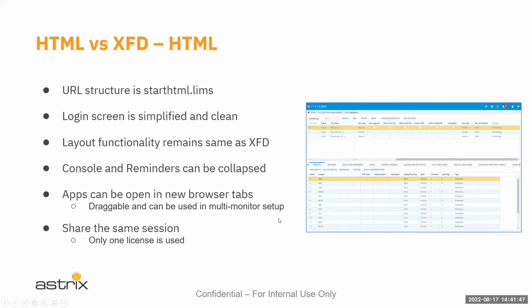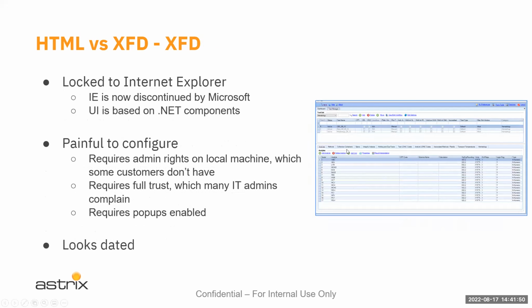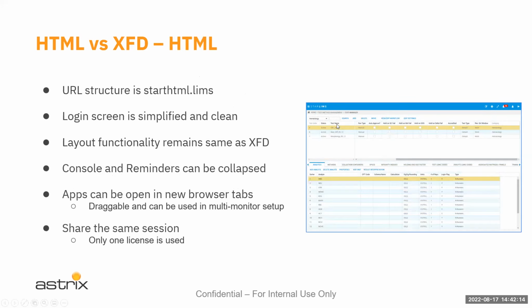Now, obviously this was built by STARLIMS, and it didn't change for several years, right? They just kept improving this and making more business functions inside of it. But the look and feel kind of remained the same with this V10 for several years, until there was a project at STARLIMS to convert everything to HTML, make it run on another browser, make it more modern, right? So this is what we have now.